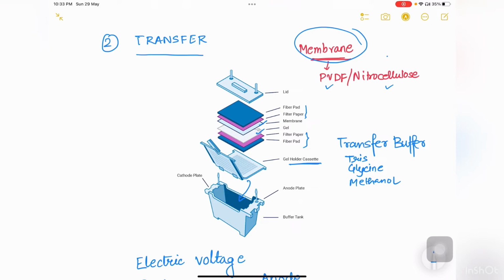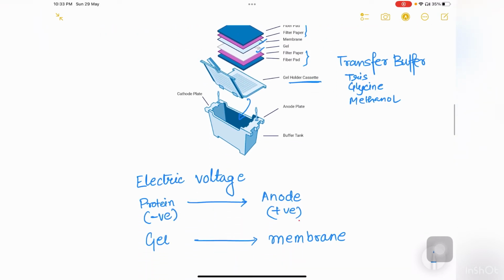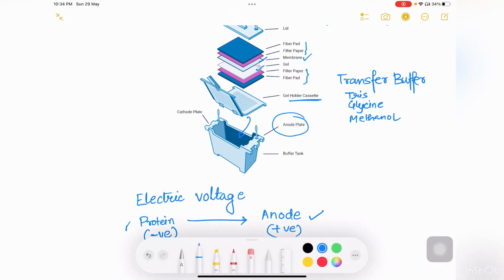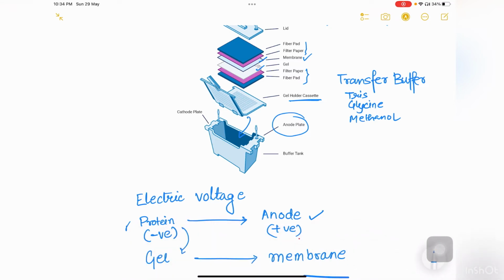So in this buffer, this gel holder cassette is placed and this buffer tank is filled with this buffer and electric voltage is applied. So now what happens? The proteins are negatively charged because of the application of SDS, right? So these negatively charged proteins will try to move towards the anode, which is positively charged because of the application of the electric voltage. And the membrane side of this cassette is placed at the side of the anode in such a way that when this electric voltage is applied, the proteins from the gel will move towards the membrane.